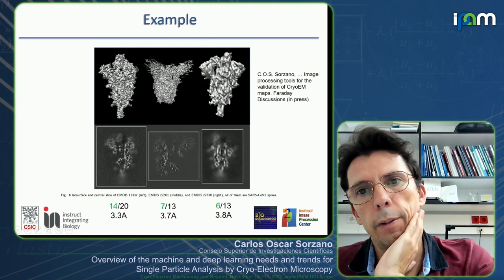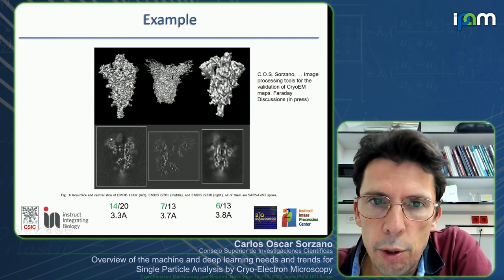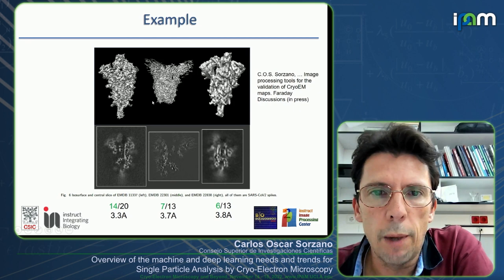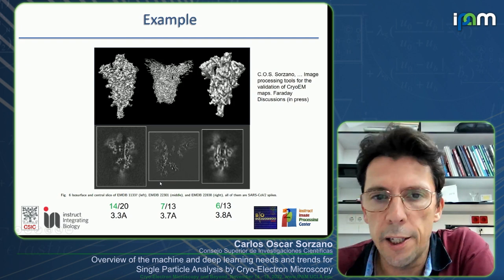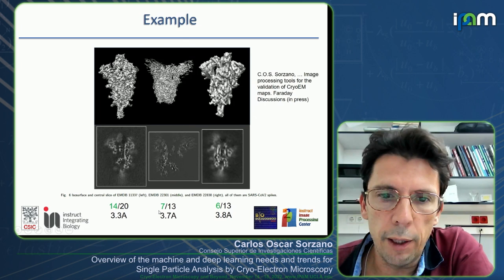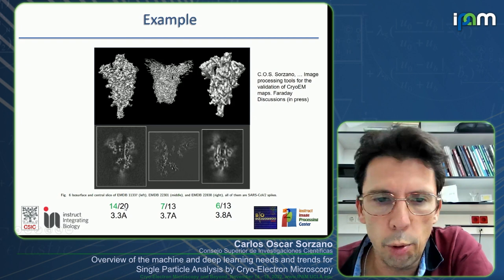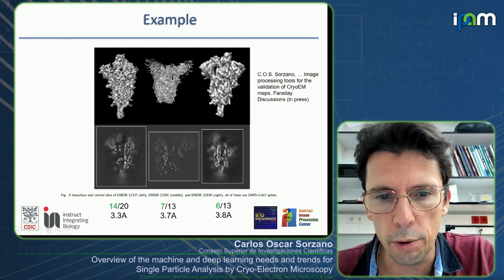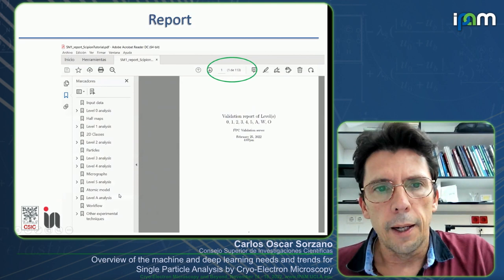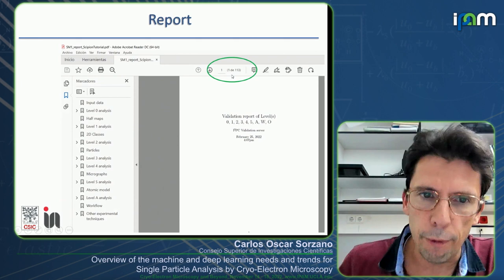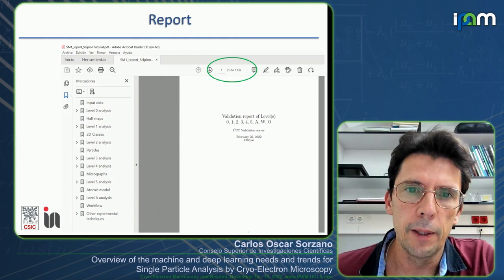Here is an example of three different reconstructions of the same molecule — the spike of the SARS-CoV-2 virus — all claiming similar resolutions of 3.3, 3.7, and 3.8 Ångströms. Yet the appearance of those maps is completely different. Going through the server, two of them only pass seven and six tests out of 13 respectively, while ours passes 14 out of 20. The report can be very detailed — up to 113 pages — and can identify any pathology in your map.